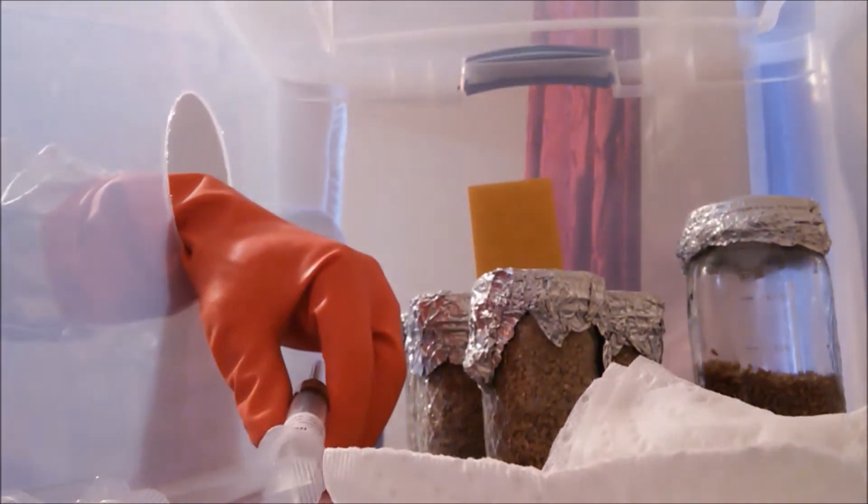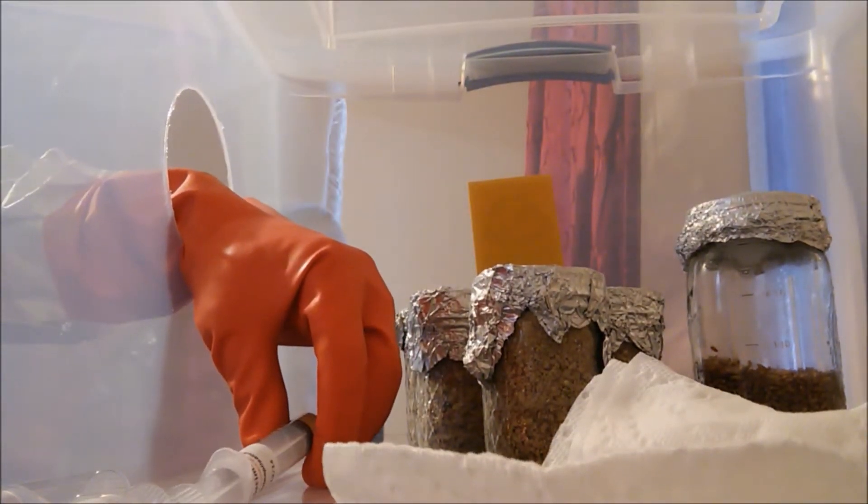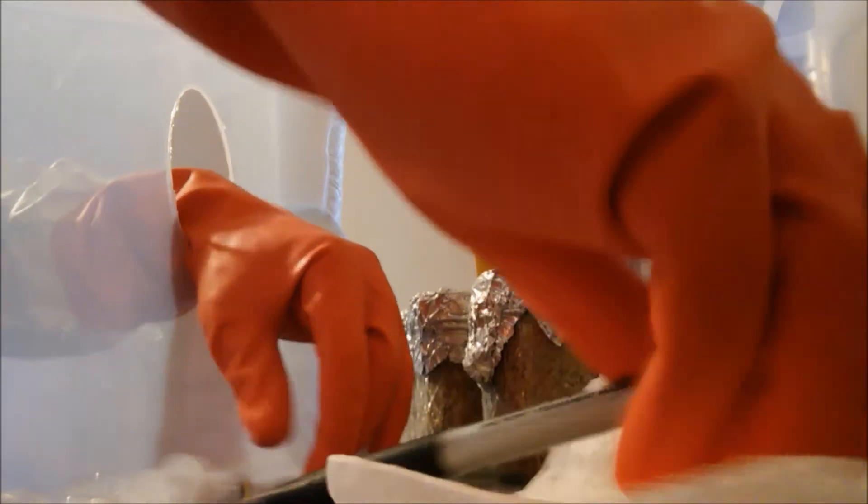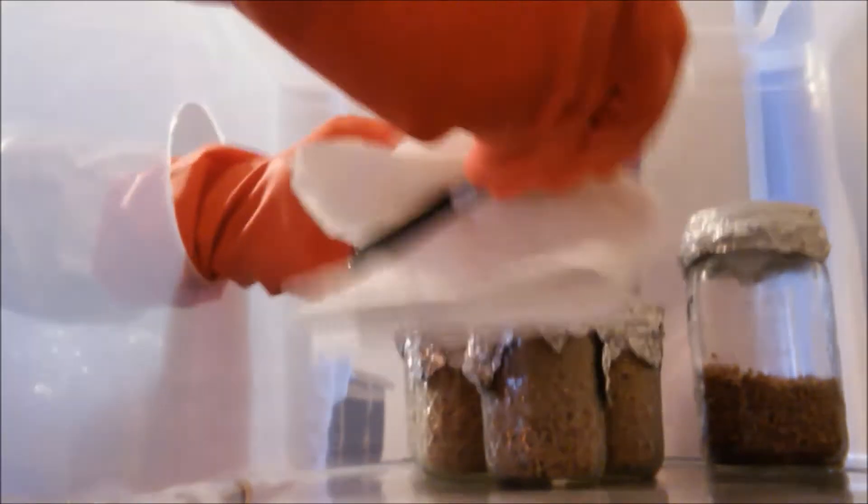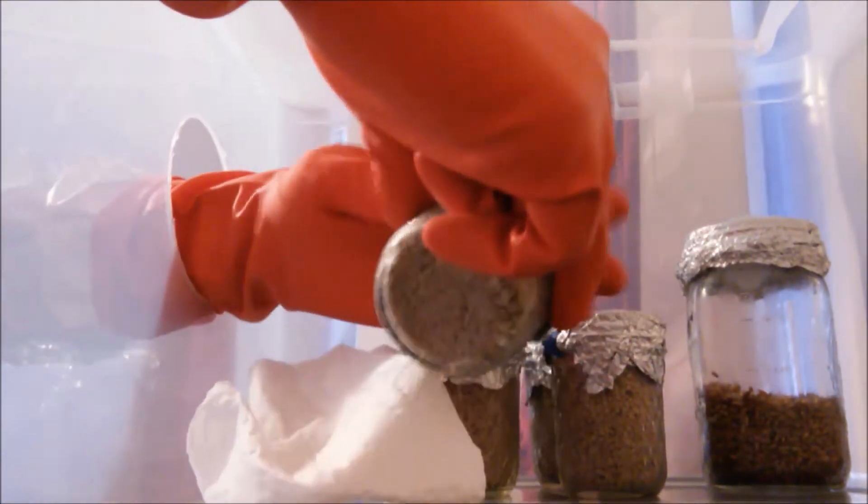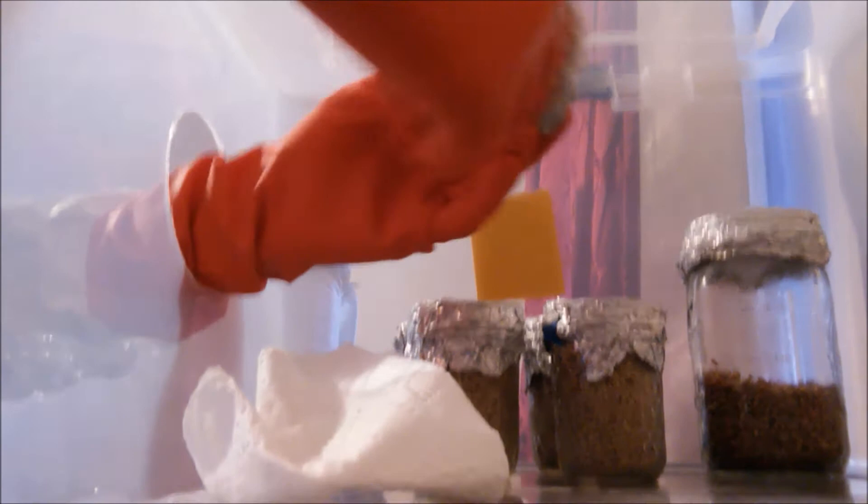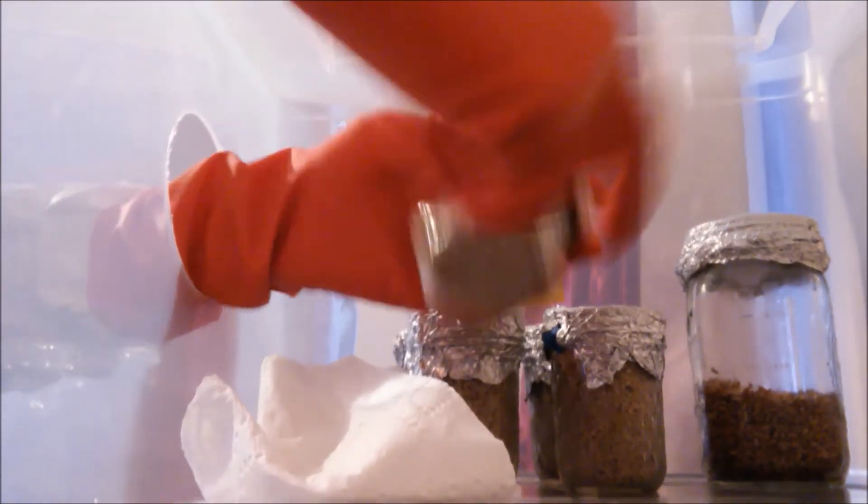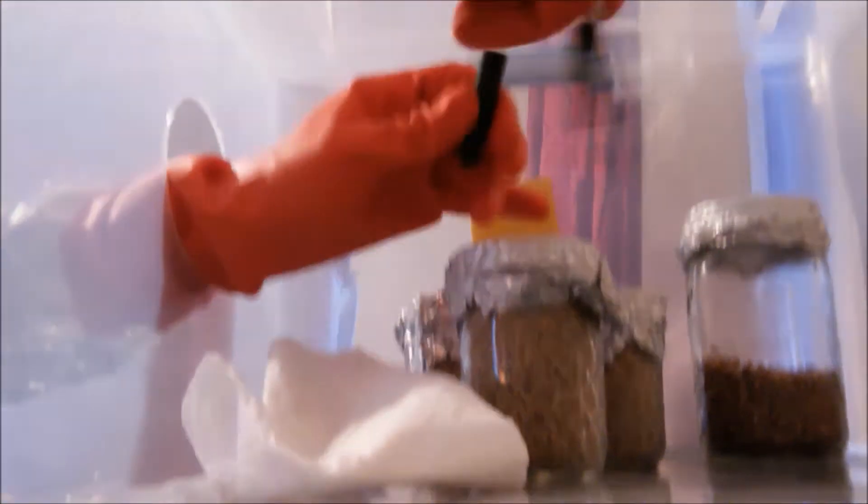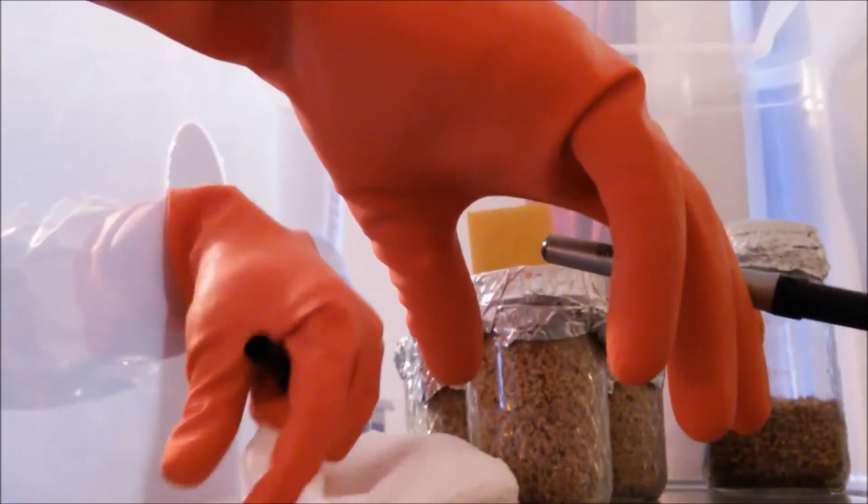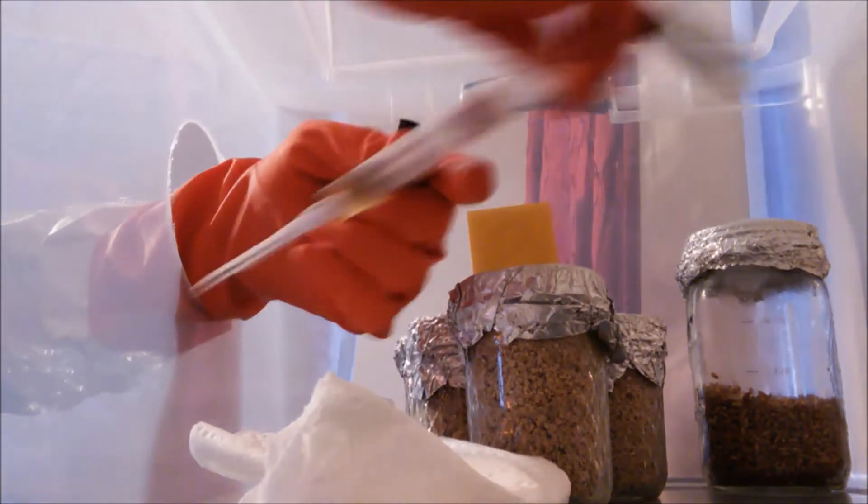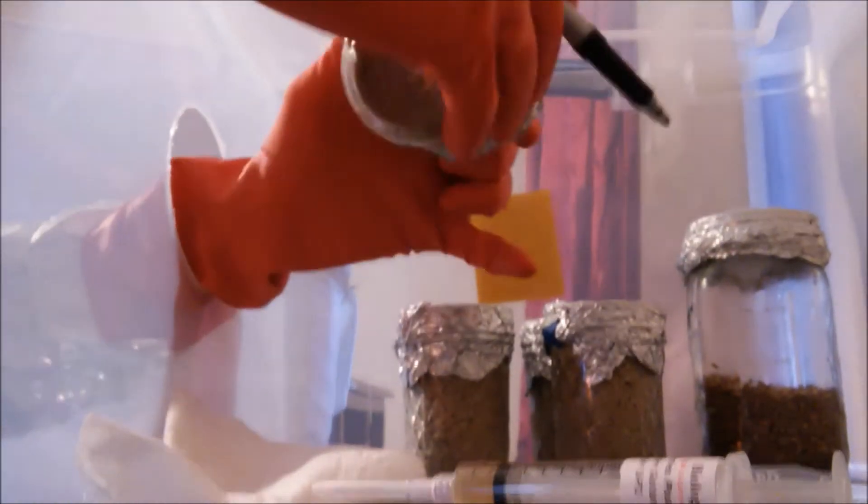So the first thing that we got to do is make sure that we label our jar. Find a little clearer spot and label it. First one is going to be actually golden oyster, so I'm going to label this as gold.